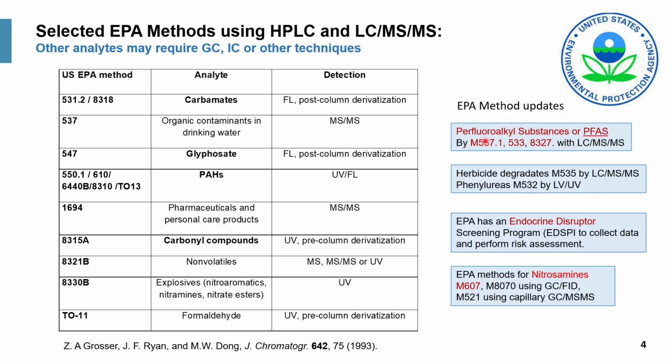PFAS stands for perfluoroalkyl substances, which are particularly important in recent years because of the discovery of some carcinogenic properties, and also the fact that these are forever chemicals. So there are a lot of concerns in the recent uproar on the level of PFAS found in human blood serums, and it really is quite pervasive and ubiquitous.